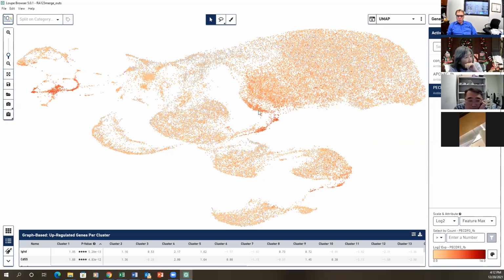So there's some here and some there, so we do need to be careful when they overlap. Now the site, it looks like everything is positive except some are more positive. It's not like they're negative. They are darker. So in the parent, we don't say positive or negative.